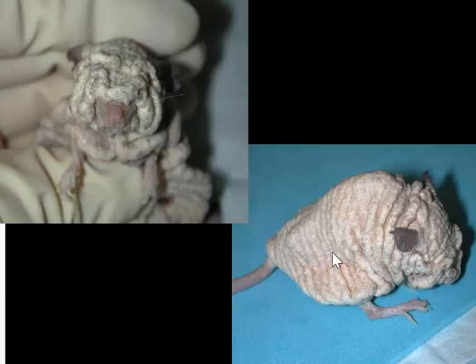But what makes the Rhino mouse very popular in various types of research dealing with the skin, even in research dealing with development of various types of hypoallergenic makeups, is that the animal has these utriculi, or very dilated follicles that are filled with keratin, which sort of give it this lumpy, bumpy appearance.